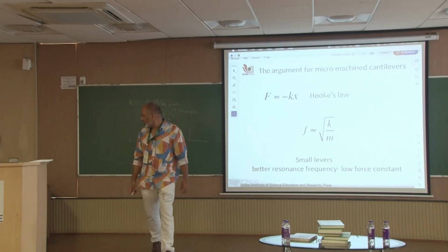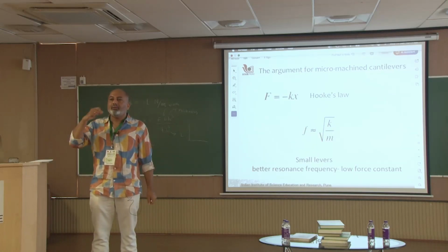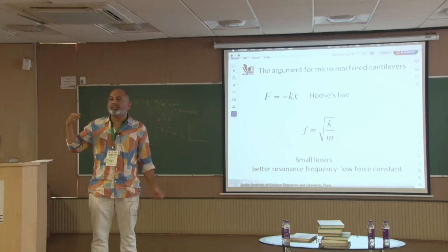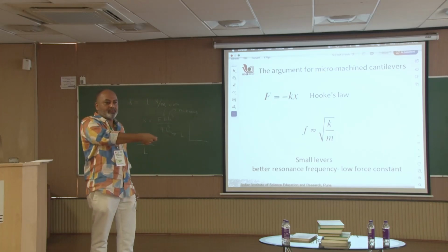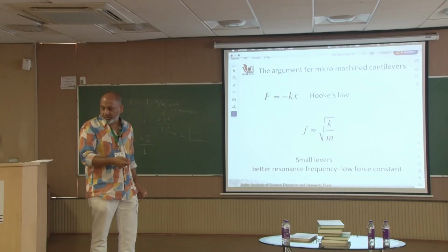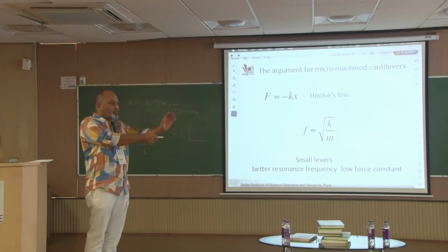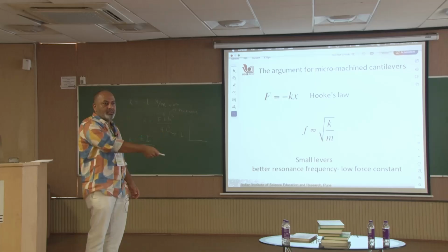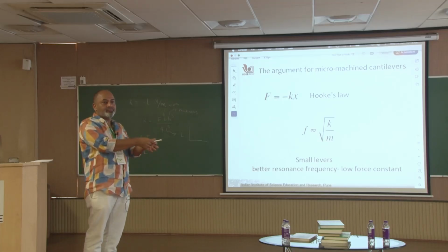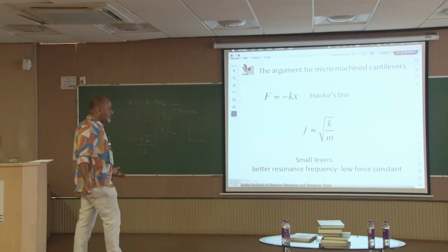Okay, we have that long thing, a meter scale. Can you see a meter scale somewhere? A long 1 meter scale. So, suppose I take a simple scale, something that vibrates. You start moving it, and it will have a large amplitude for a small movement, right? Or you can do a rapid movement and the amplitude becomes more, right? This happens all the time in resonance.